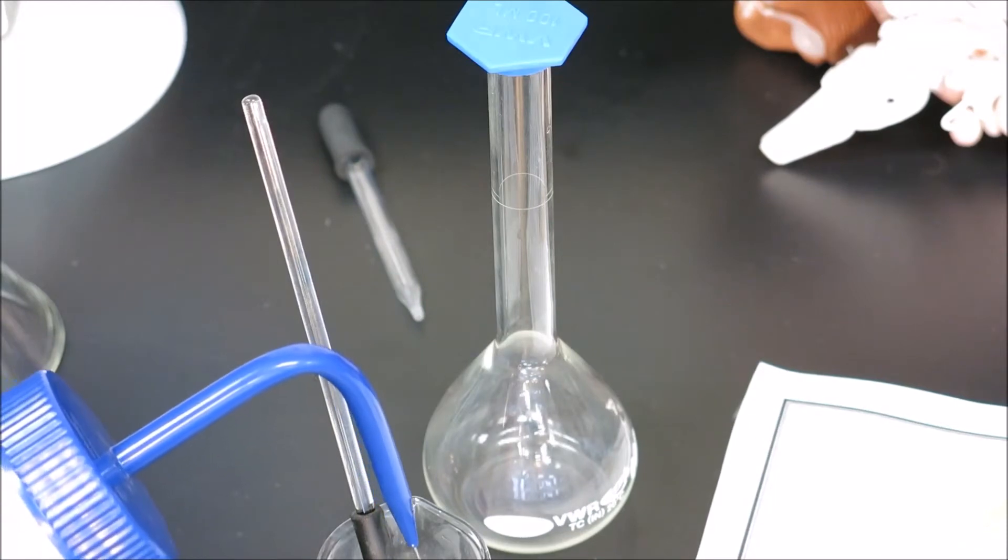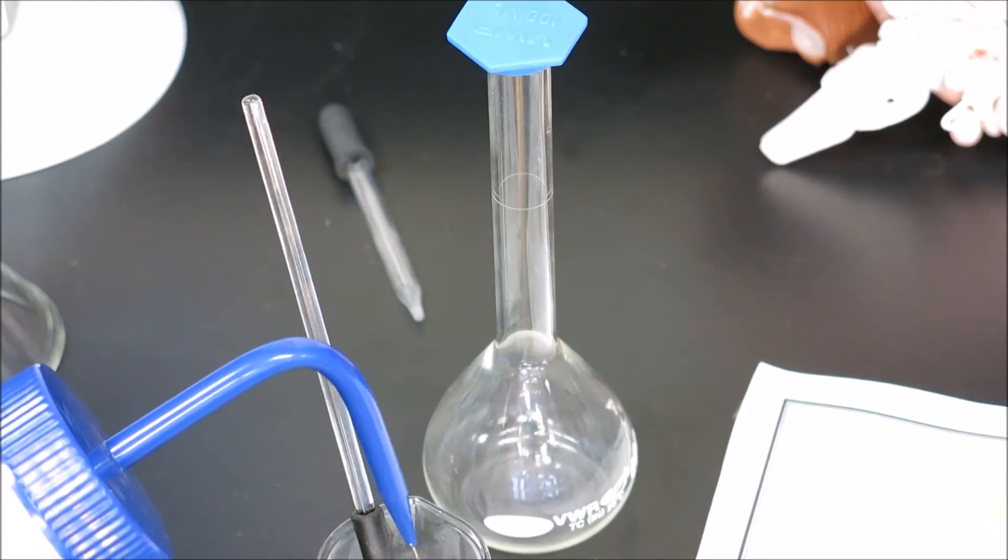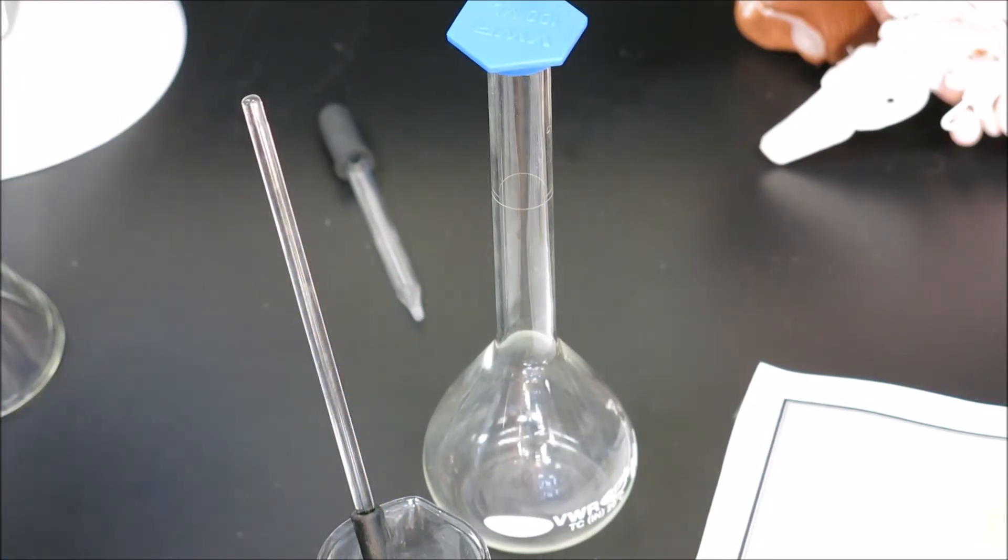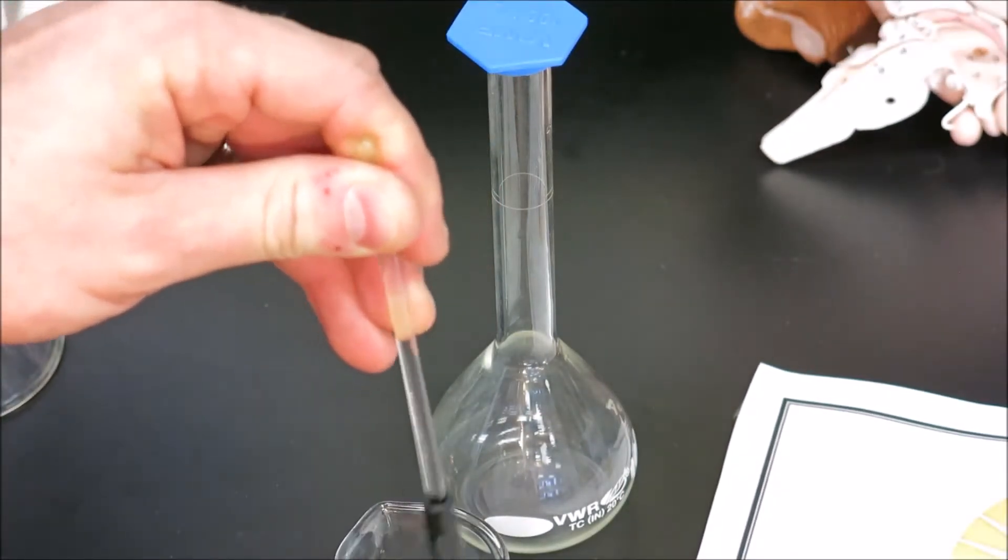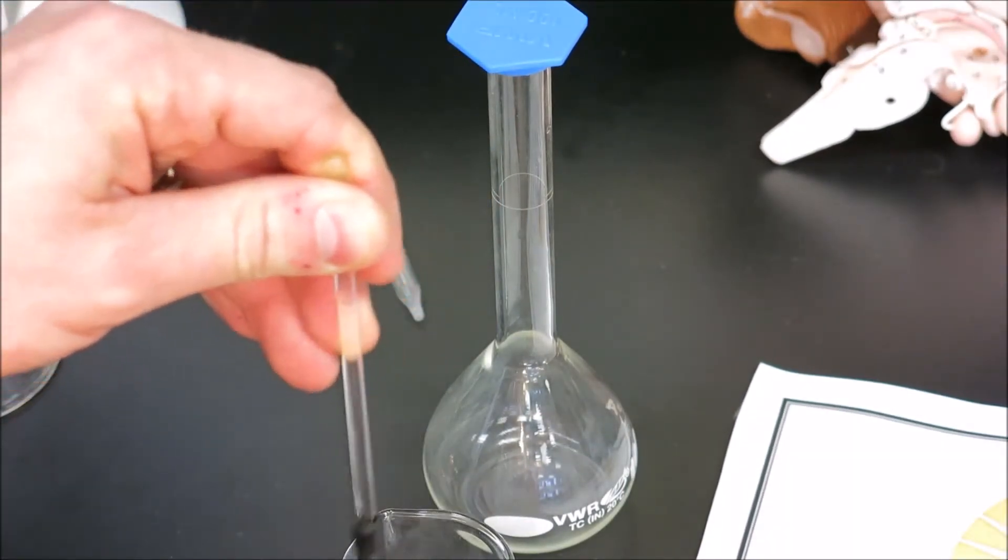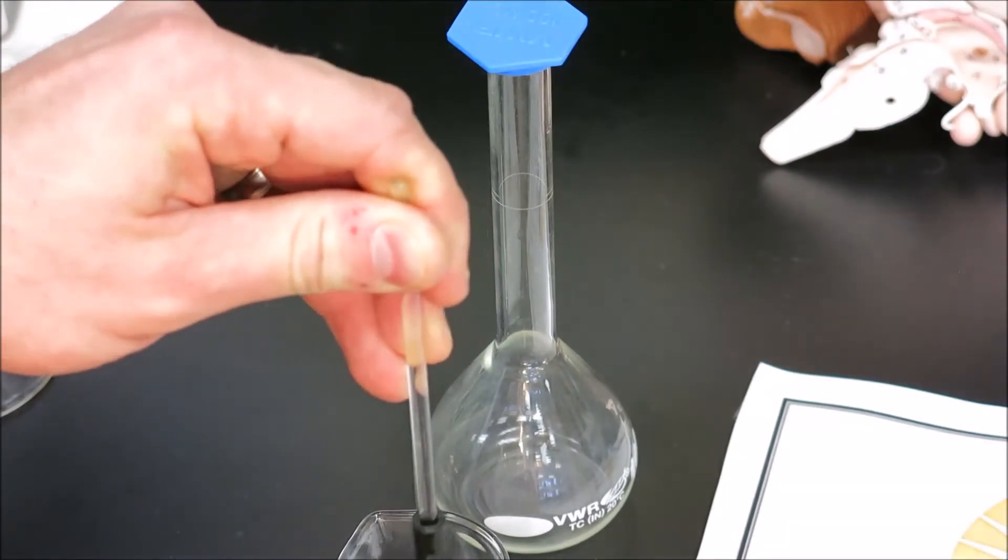The key is not to add too much water because our volumetric flask is 100 milliliters. A general rule of thumb is to use 15 to 20% of the flask volume as the initial dissolved amount.